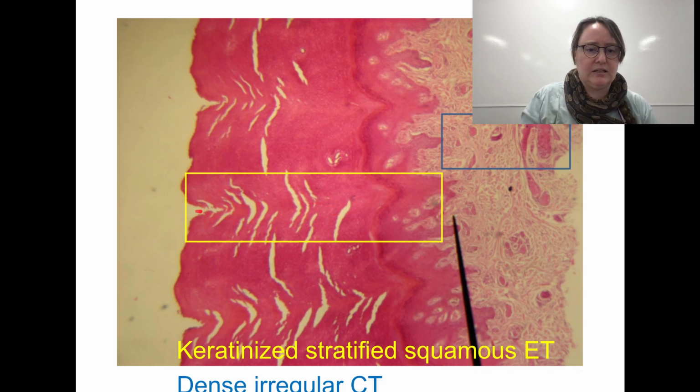And here is the squamous epithelium. I wish we could zoom in, because this is thousands upon millions of cells all layered on top of each other. Here we zoom in a bit more and we can actually see all the squamous; these little white dots are the nuclei, because they're keratinizing as they're moving out. We're going to talk about that in chapter 6.